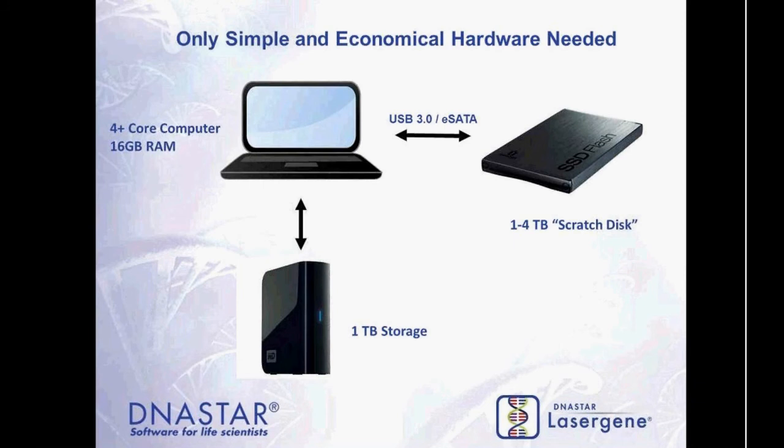The size of this depends largely upon the size of your reference sequence used and the amount of sequence data that you're attempting to assemble. So since we're working with human data in this particular webinar, we'll want a larger number of terabytes available on this scratch disk. We would also recommend having a 1 terabyte external hard drive for storing output files from your assembly.